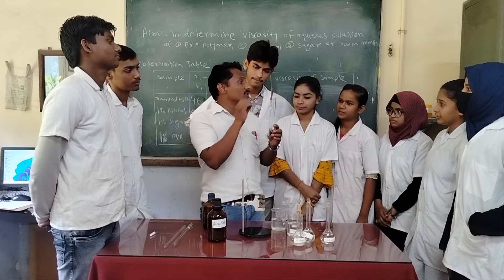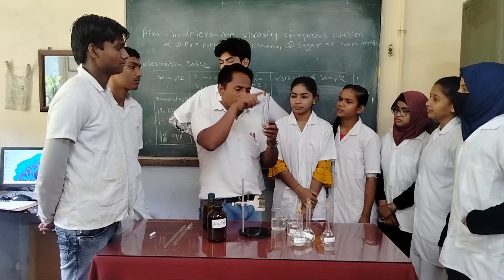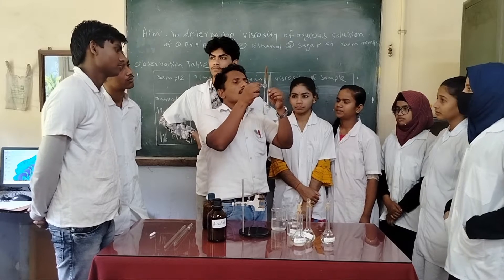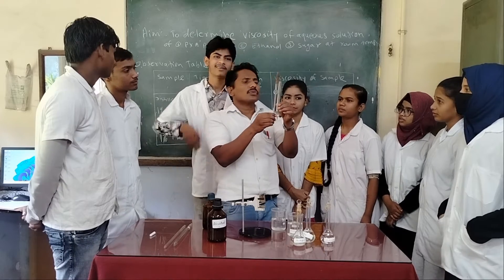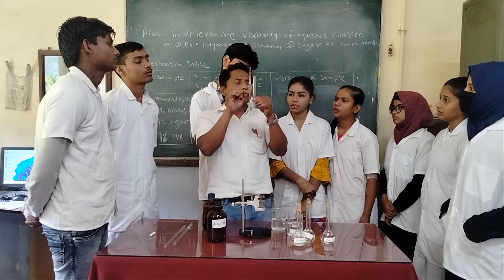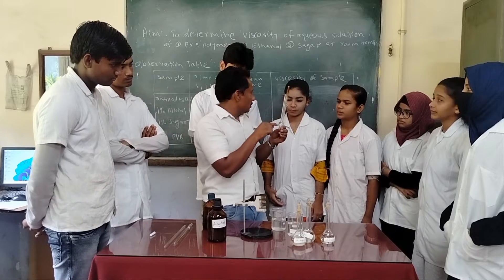This viscometer is used to determine the viscosity of aqueous solutions — solutions that are water-based. The viscometer has two important parts: the upper bulb and the lower bulb. It is made up from glass. The upper bulb and lower bulb are connected by a uniform, thin capillary, and there is an upper and lower marking. We are going to measure the time of flow of liquid from the upper marking to the lower marking.